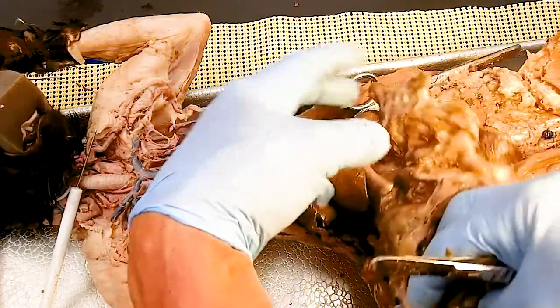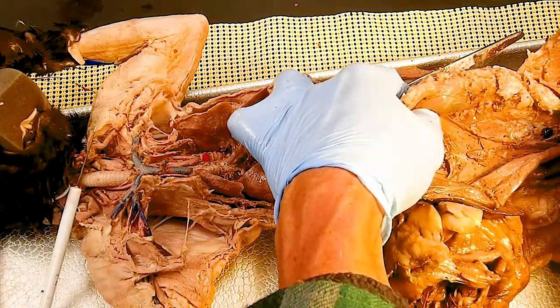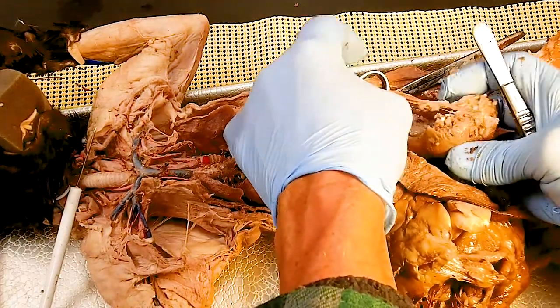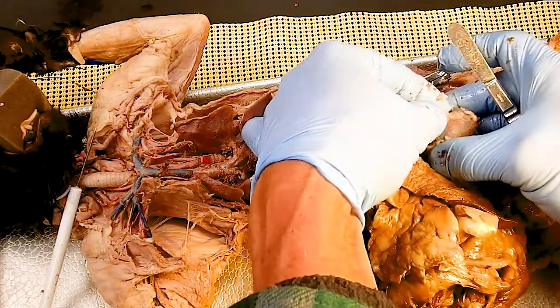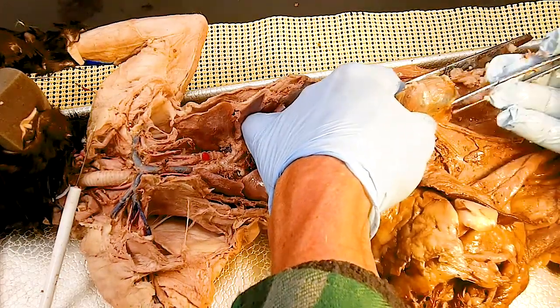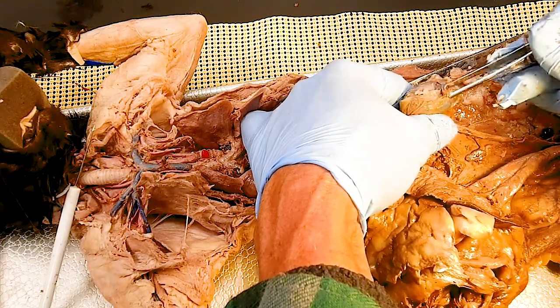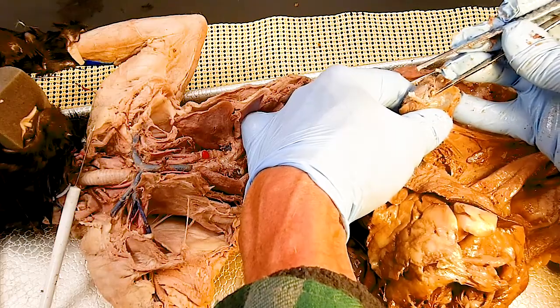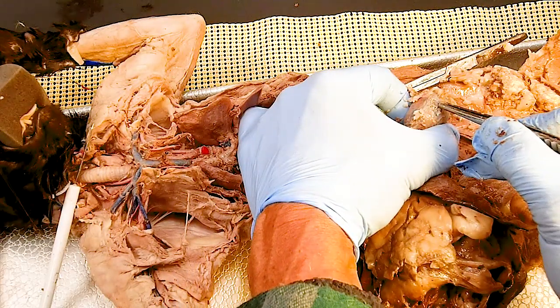Oh, while we are here, let me look at the kidneys, see if they're intact a bit. All right. Since we did the renal system also, here's the kidney. They often have a lot of fat around them. It's protective. They're not that well protected by bone. But that's a kidney. It's got its own little connective tissue capsule. There, I've cut a bit of it away. All that blue is latex from the injection. But right there, you can see the capsule.